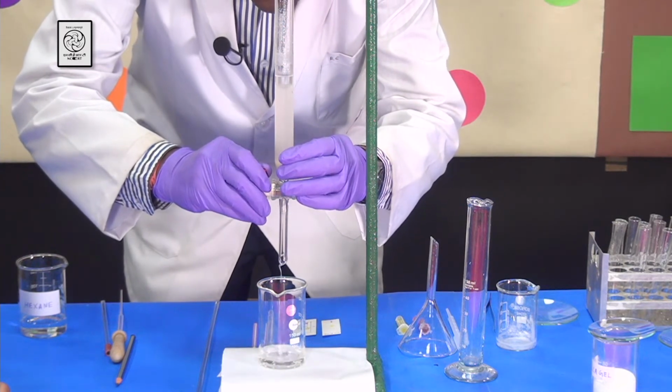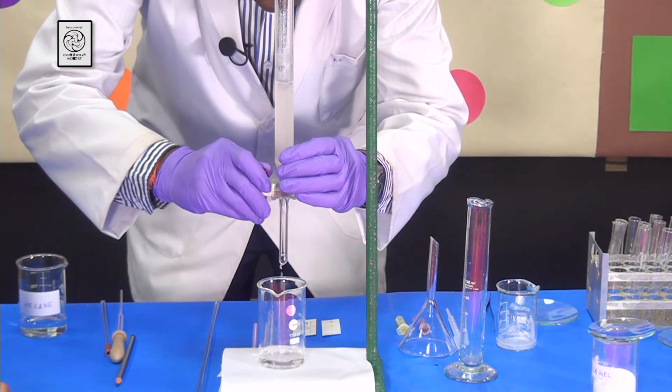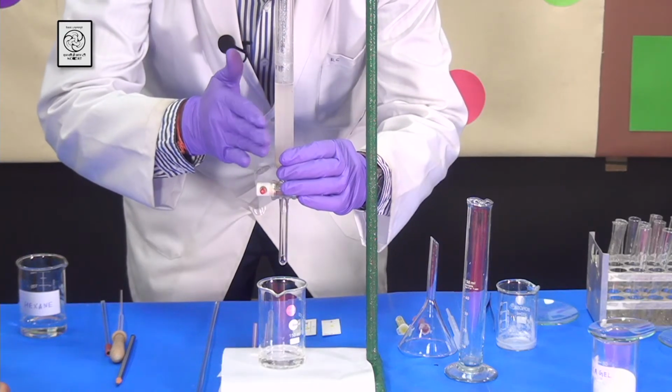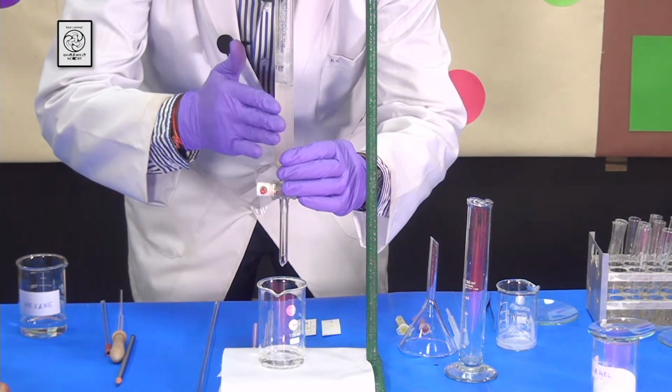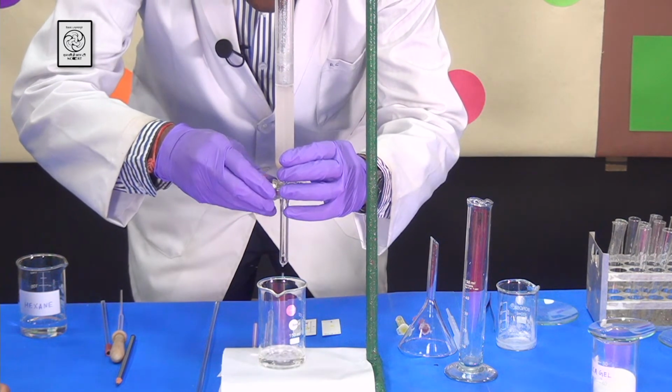Now you tap the column a few times and then release the stopcock and let the solvent pass by. Then you close it. Again you tap it nicely so that it settles down nicely, and then again you open it.